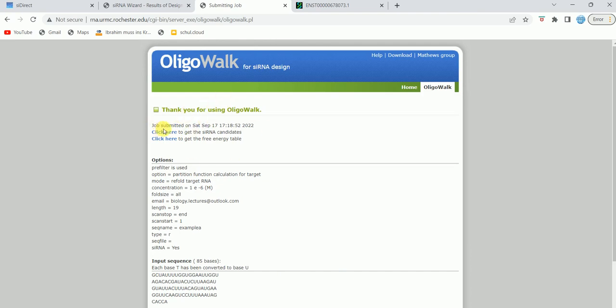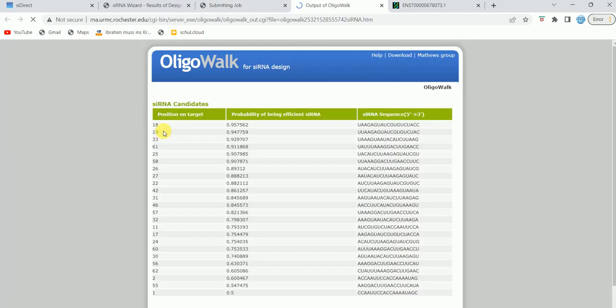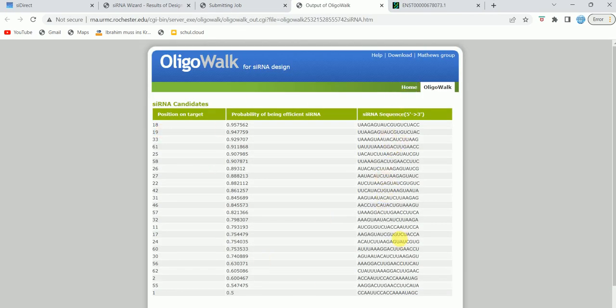I submitted it and then here I can click to get the siRNA candidates. You can see that this is the siRNA sequence and these are the list of candidates for my sequence.